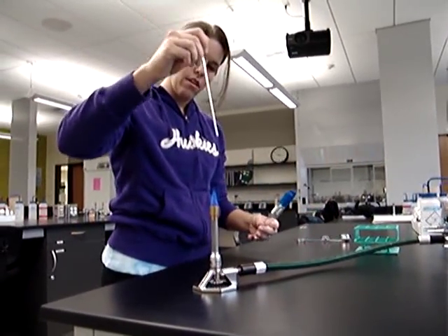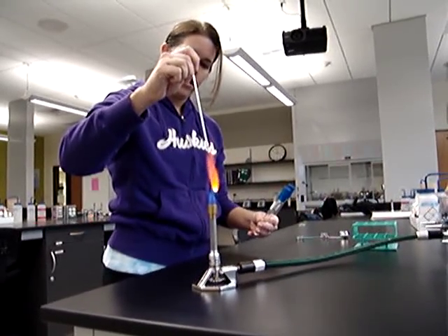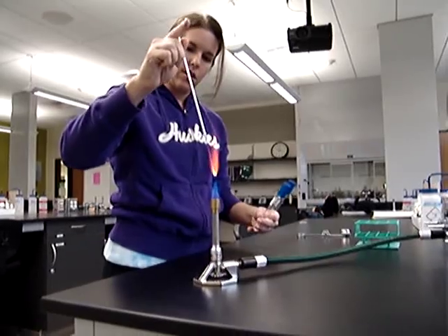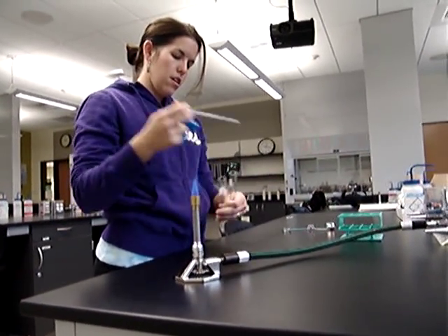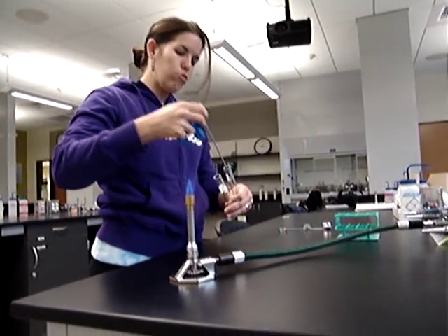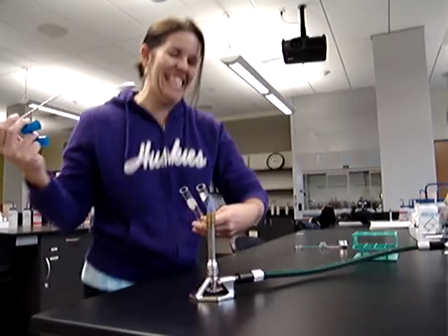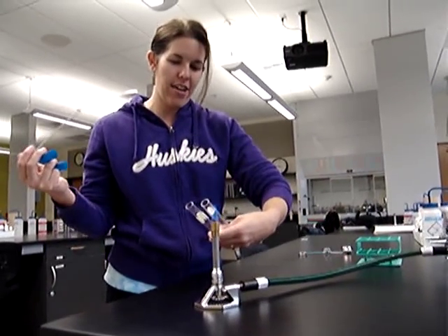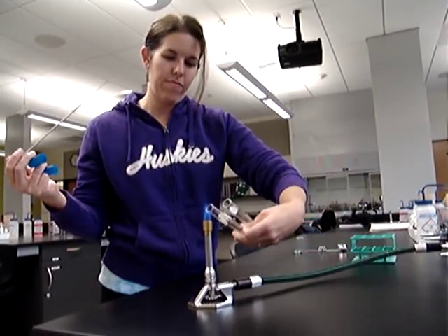Like that, right? Yeah — you want to flame the loop until it's almost all the way orange. Oh shoot, there's something else. You need to flame the loop. All right, sorry. We better start over — this is bad news.